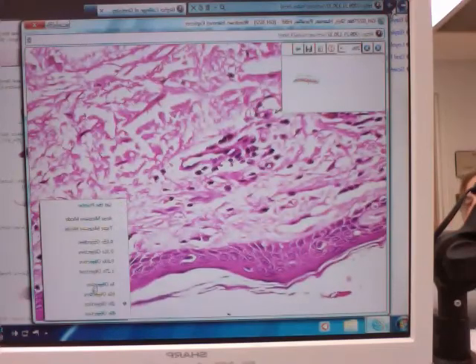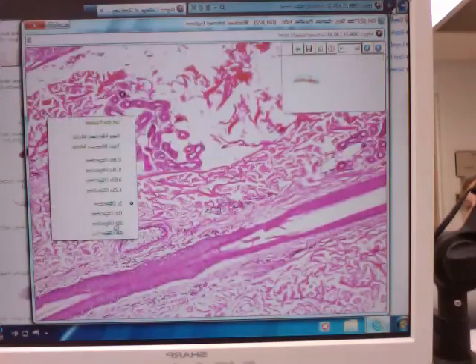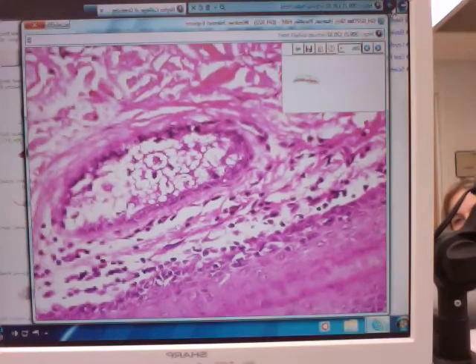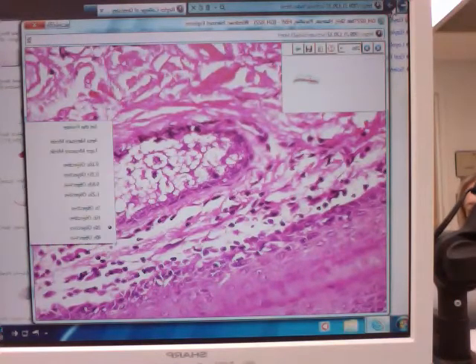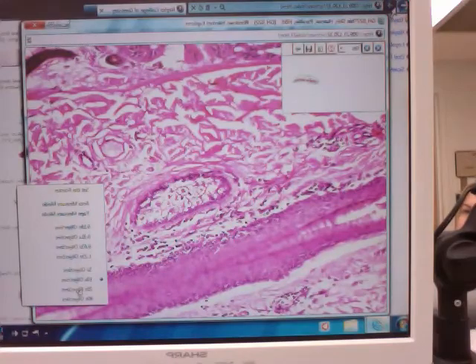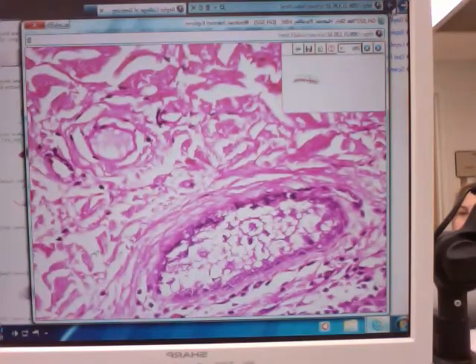There'll be lots and lots of dense irregular, and then we get to areas over here where we can see this structure. Now, Dr. Opperman is a very kind and gentle person, so she's probably going to show you hair follicle in place or something so you can tell what that is. If it were me, I wouldn't do it. I just bring it over here and I go just like this. Because it's easy to tell anyway. This is going to be what we call a sebaceous gland.